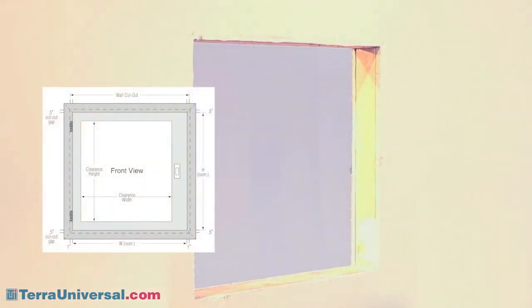Before you start, prepare a framed cutout that is two inches wider and one inch higher than the nominal width and height of the Clean Seam Plus chamber. To minimize disruption of your clean room, you can enclose this area with plastic sheeting to contain wall dust and debris.